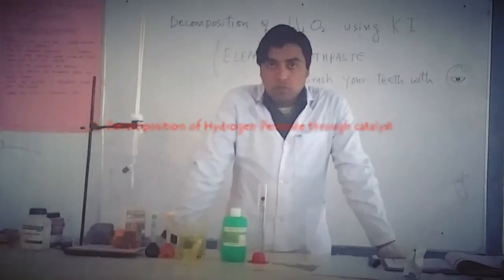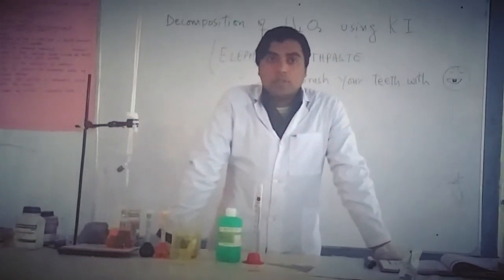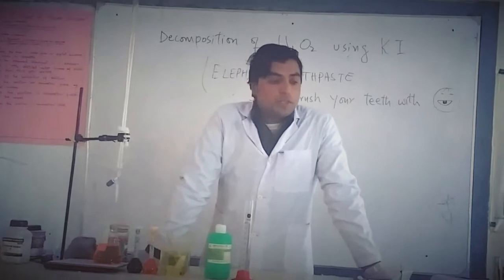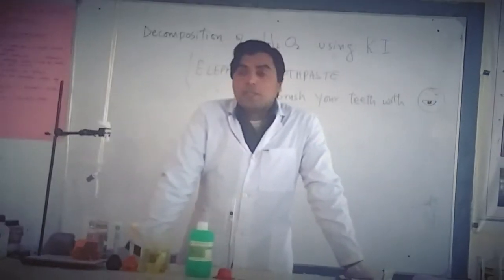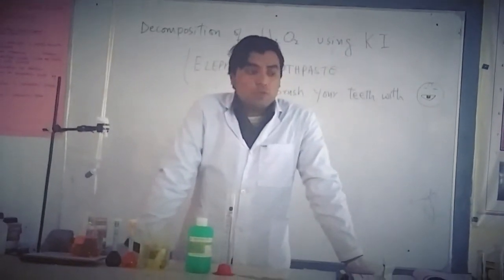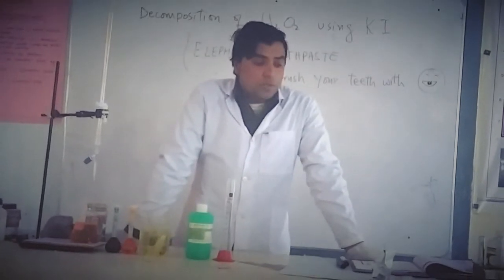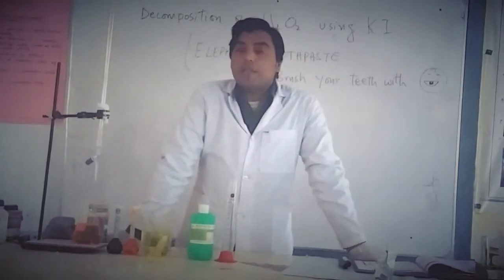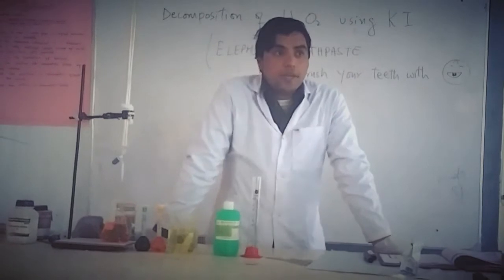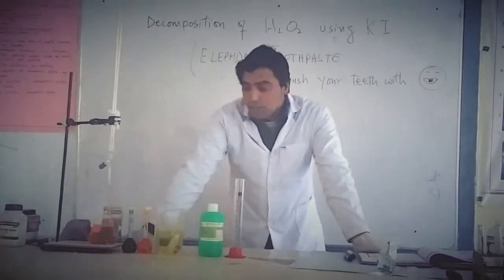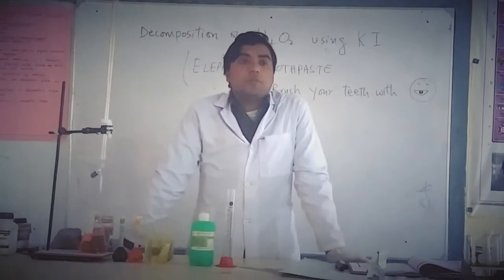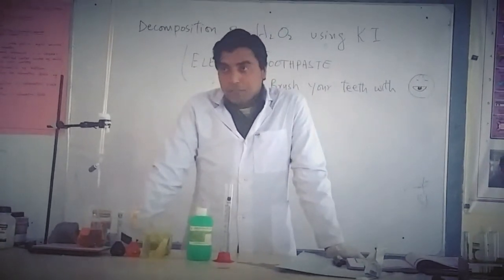The decomposition of hydrogen peroxide with the help of a catalyst. We are going to start with potassium iodide and manganese dioxide. To make the experiment interesting, we will also add food colour and liquid soap.